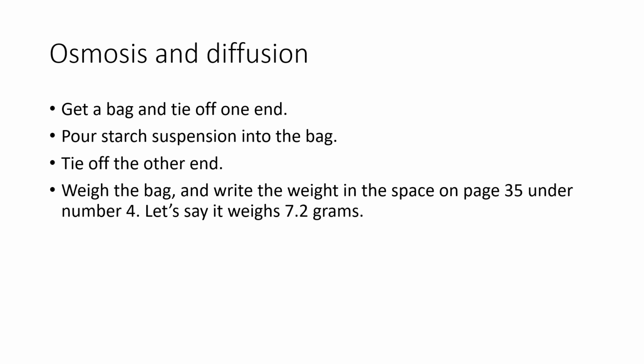So normally what we would do is make the bag and then weigh the bag. And so what we're going to do, under number 4 on page 35, that first blank, it says, what is the weight right after you make the bag? We're going to say 7.2 grams. It's a weight that I have gotten before in the lab, and so just go ahead and fill in your blank with 7.2 grams.